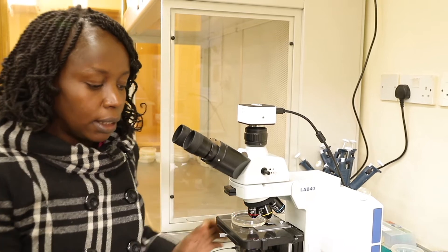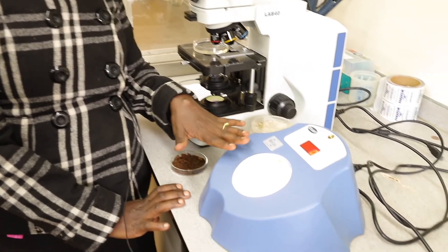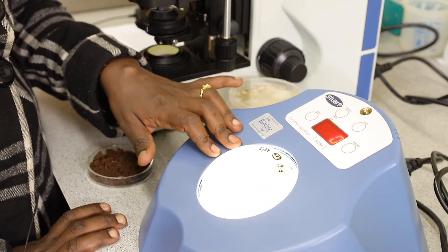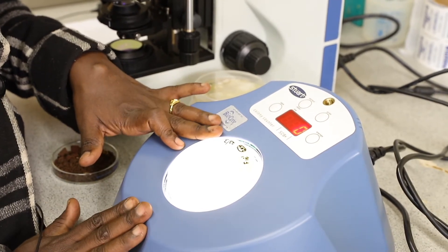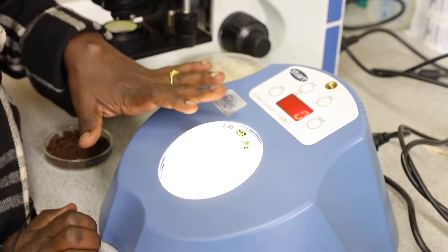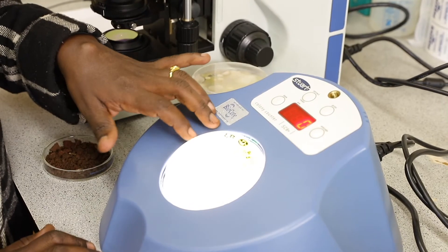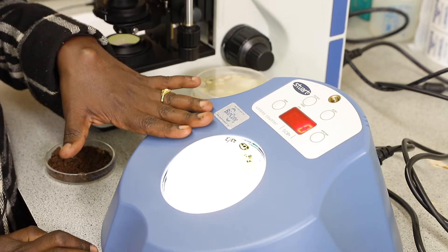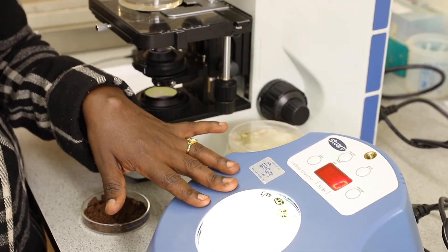We also have these organisms that we use, which you cannot extract and observe through a microscope. So we give them food, or what we call media. As you're seeing, this is a plate that has fungi. You can see the different colors, which shows that there are different species of fungi in this soil. What we do is prepare media, inoculate soil into this media, and then incubate for seven days, after which the growth starts appearing.